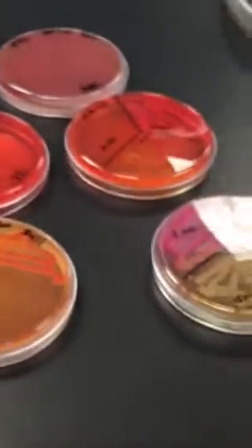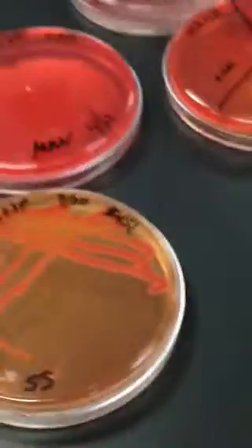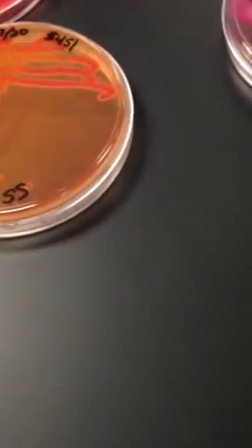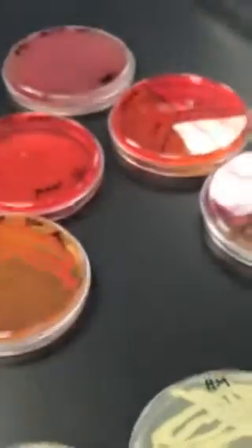So when it comes to your Salmonella Shigella agar, if you got the black precipitate, it matches your Salmonella plate, the tri-plate where the Salmonella is. You know you've got Salmonella. Very few bacteria make that black precipitate. If it's growing, but you don't have the black precipitate, maybe it's E. coli or something else.